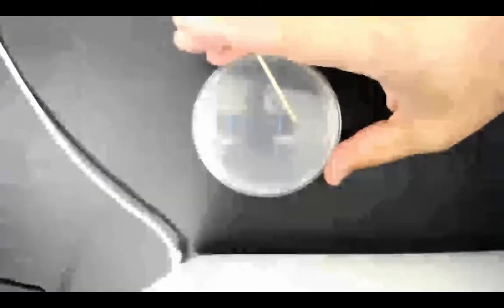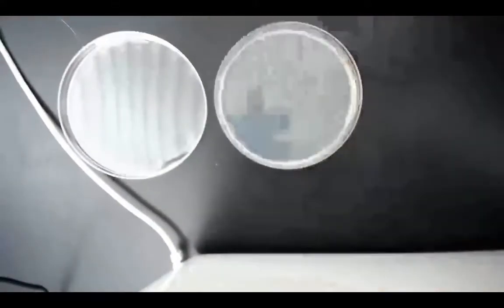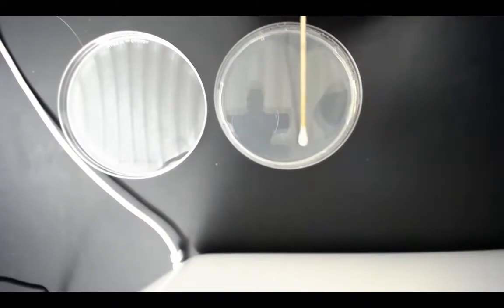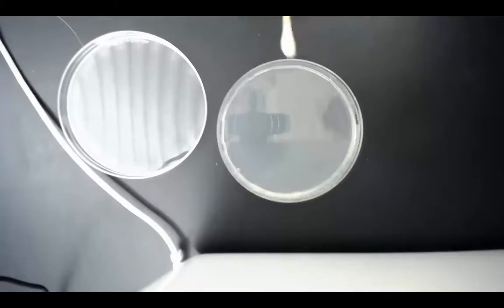And then I'm going to go over to my plate, I'm going to take the top of my plate and I'm going to turn it over — being careful not to touch my cotton tip applicator to anything else because then I'm transferring other microbes. I'm going to start in the middle, I'm going to swab back and forth at the same time that I slowly twist my applicator, because I probably got a bunch of microbes all over all sides of it. I'm going to go halfway through and then turn my plate 90 degrees so I can just keep doing the same thing.